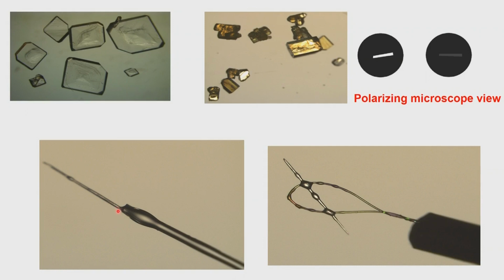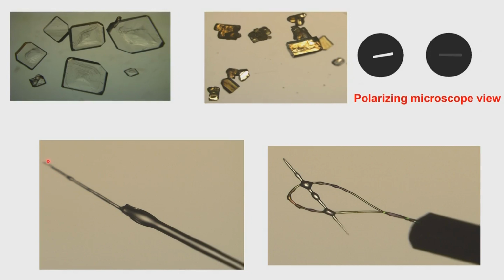If we are doing non-ambient crystallography and particularly variable temperature crystallography and so on, then the crystal has to be protected because we are going to change the temperature and pressure. So, for such a purpose we can enclose this crystal inside a capillary called the Lindemann capillary. This Lindemann capillary has the property that it will not absorb or diffract X-rays, and as a consequence it will just be the container which holds the crystal.